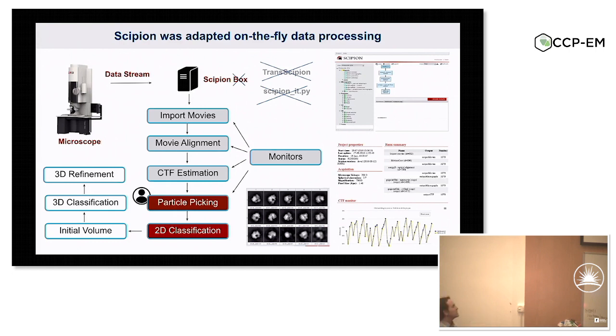And what we did is, okay, let's modify how the processing is done. Before, with the framework, you started one job, you had the input, and until this job finished, you didn't get the output back. Then you could concatenate new steps and things went on. Now we say, okay, if you have the data stream coming, we call it an open set.